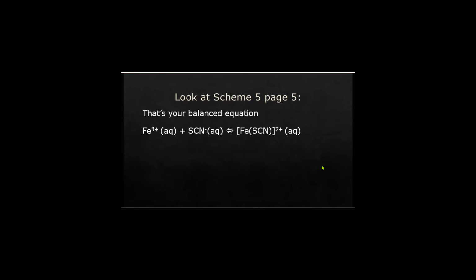Now, the other thing I'm going to want to put in my notes is just the clues I've given you in the scheme about how you know which side of the equation you're on. So are you back at reactants, favoring reactants? Or as we say in the business, push to the left, then that's pale yellow. And then if you push to the right or you're favoring the product side, it's going to be red. So make sure you write in your indicators as well.